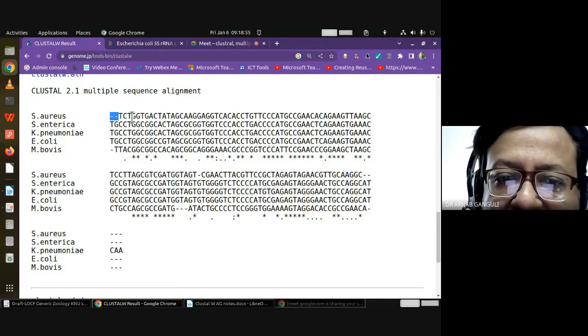And these star ones, this G G G G G G, star is there, if you see this whole line, this is all aligned.